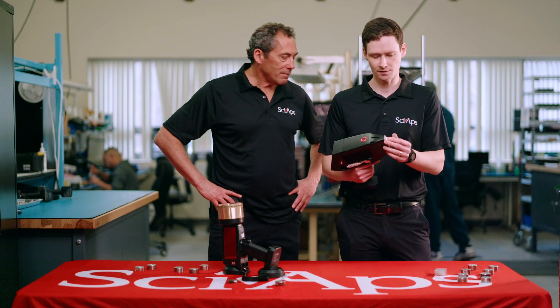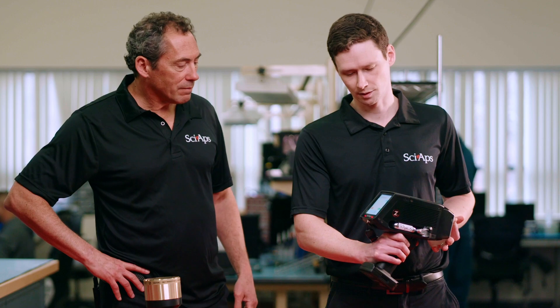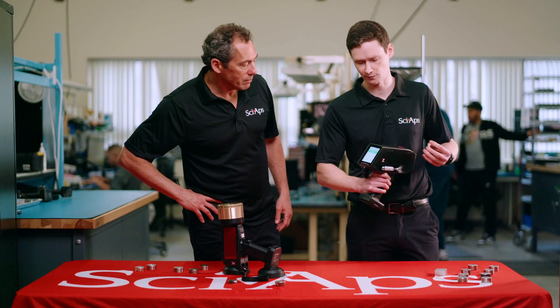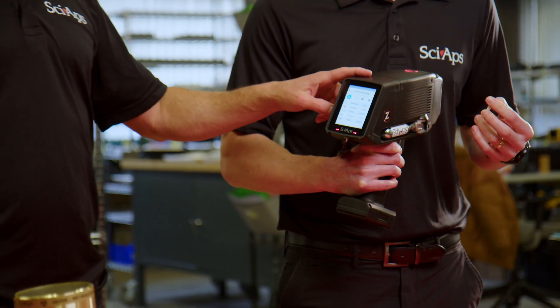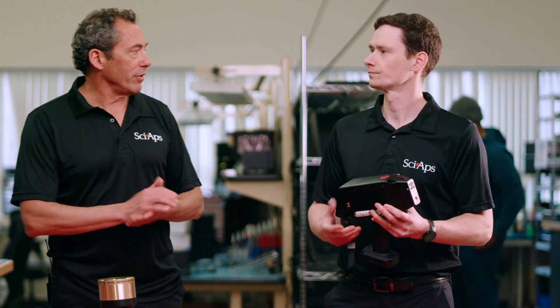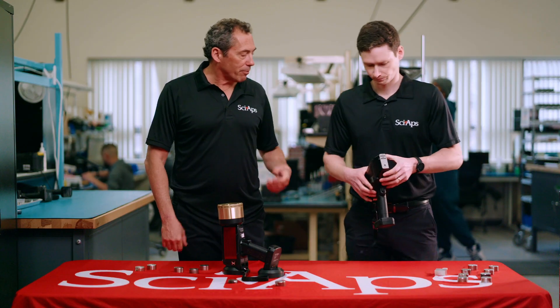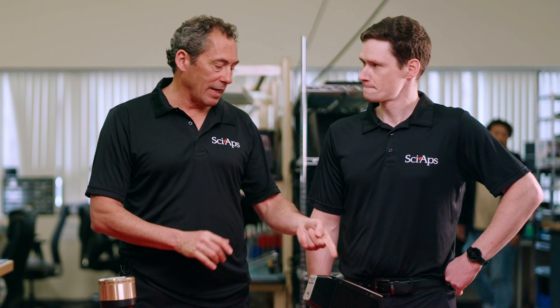LIBS is a contact measurement, so you hold the sample up and pull the trigger. It only takes a few seconds, and we've got lithium and many other elements that can be analyzed all at the same time with this technique — the key one being lithium. Why? Because you cannot measure lithium with a portable XRF device. Lithium has too low an atomic number; the X-rays are way too light to be measured with that kind of device. Even though you have to press a pellet, it's still much faster and more immediate than sending a sample to a laboratory for digestion and ICP analysis.